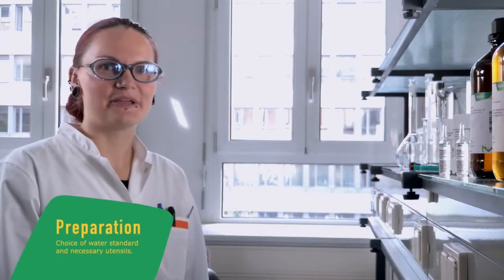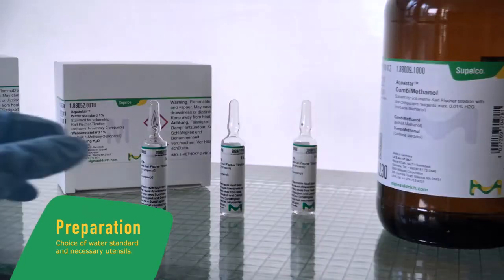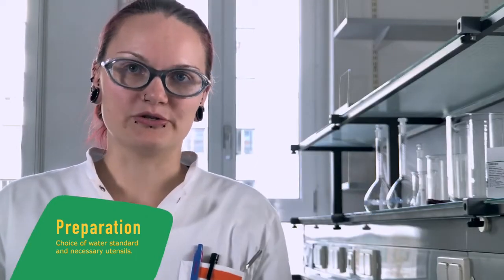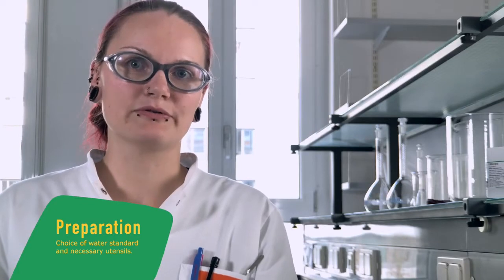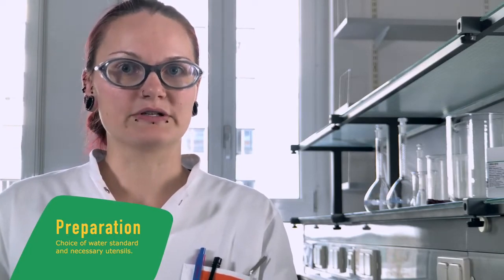First thing I do is pick all the stuff I need for the Titer determination, which is the liquid water standard 1%, which is easy to use and has a high accuracy. But you also could use pure water as a standard. In this case you have to weigh in very small amounts, which makes it hard to handle, and also the weighing error is quite big.